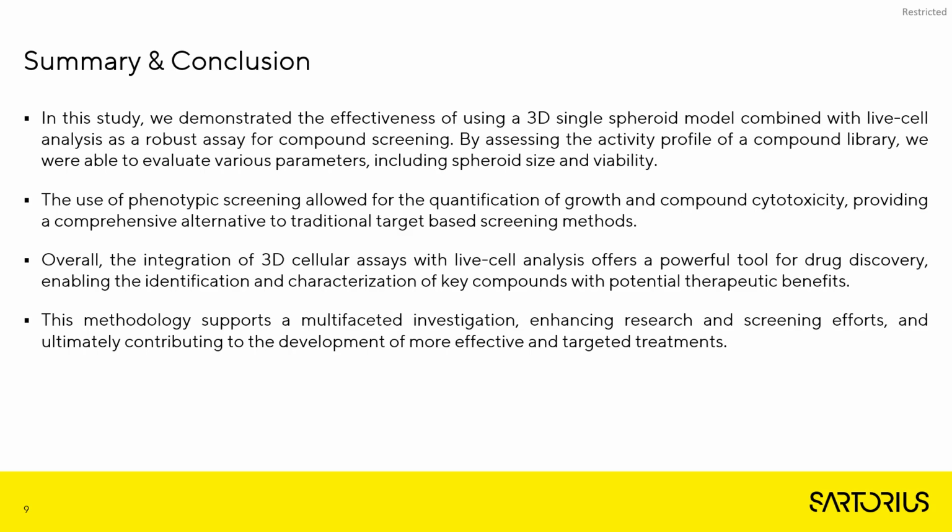So, summary and conclusion. In this study, we demonstrated the effectiveness of using a 3D single spheroid model combined with live cell analysis as a robust assay for compound screening. By assessing the activity profile of a compound library, we were able to evaluate various parameters, including spheroid size and viability.